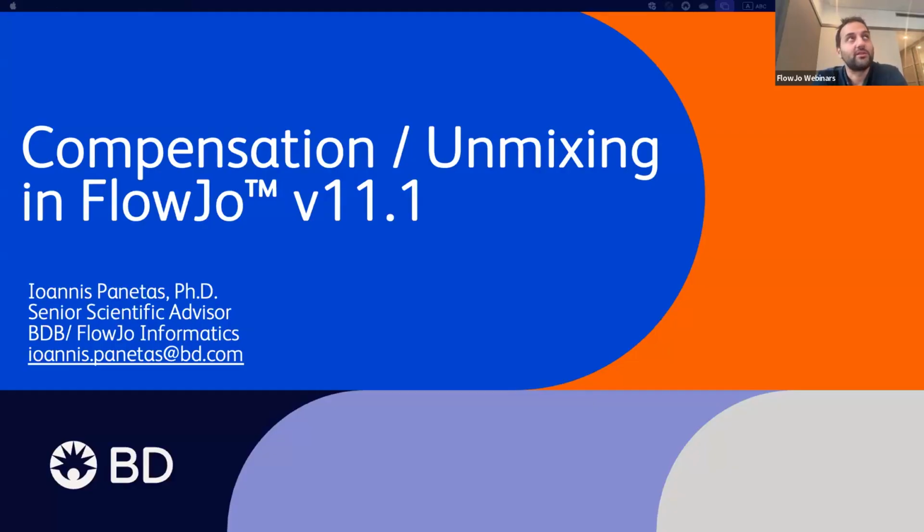I will show you methods we can use in order to compensate depending on different types of data we might have. For example, as we said already, traditional data or spectral data. And then I will show you, of course, everything will be centered around FlowJo version 11, and specifically version 11.1, where I will highlight also how everything works out within version 11 with a demo.